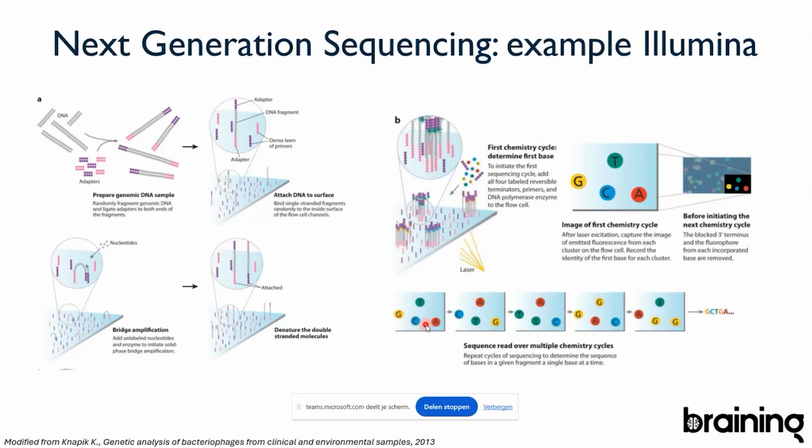So that's basically what you see here. For the left cluster, you have a guanidine, cytosine, thymidine, guanidine, adenosine, right? And the high throughput concept comes from having different clusters on the same flow cell, and all those different clusters can be read out at the same time. So that's how Illumina sequencing works. As I said, it's one of the more common short read sequencing methods, at least.